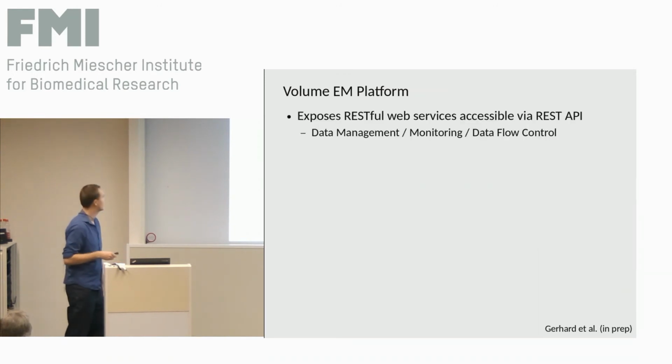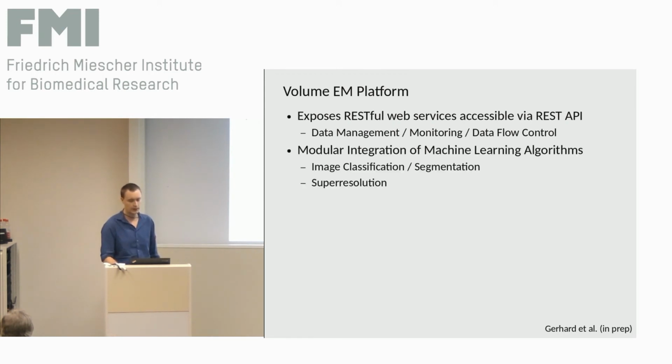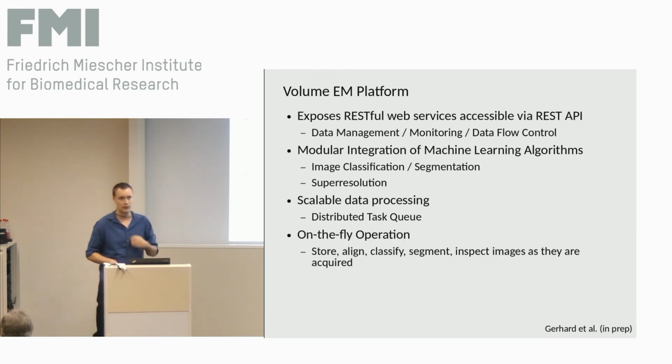And yeah, I think time is already almost up. Just as an overview, a summary: this platform gives you a RESTful web service API that is accessible via REST. This is for data management and monitoring, or data flow control. The system is also built in a way that you can modularize analysis codes for classification and segmentation, for instance. And there's a scalable data processing aspect with a distributed task queue, and also these on-the-fly operations on all aspects of the whole process, which are quite important.